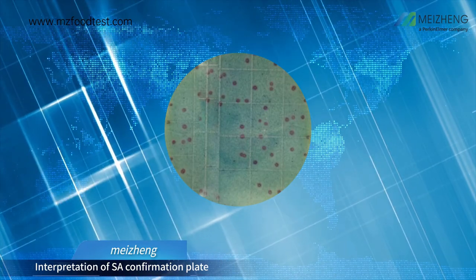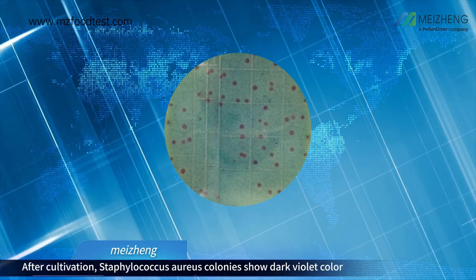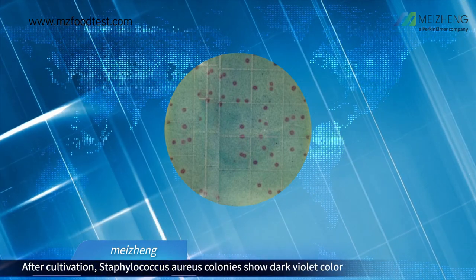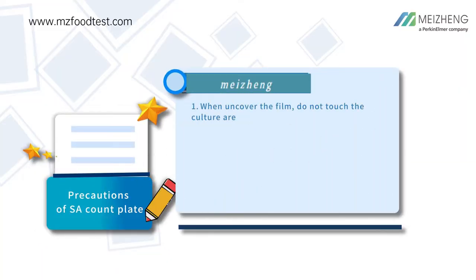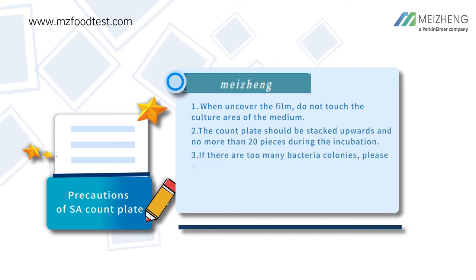Interpretation of SA confirmation plate: After cultivation, Staphylococcus aureus colonies show dark violet color. Precautions of SA count plate: When uncovering the film, do not touch the culture area of the medium.